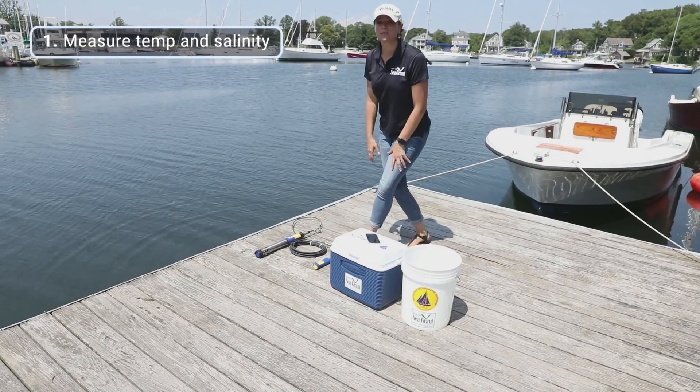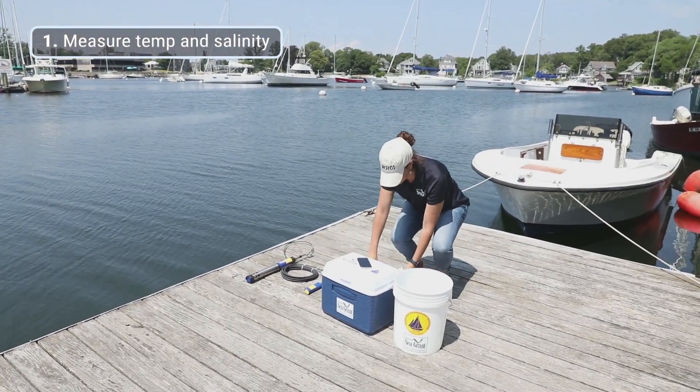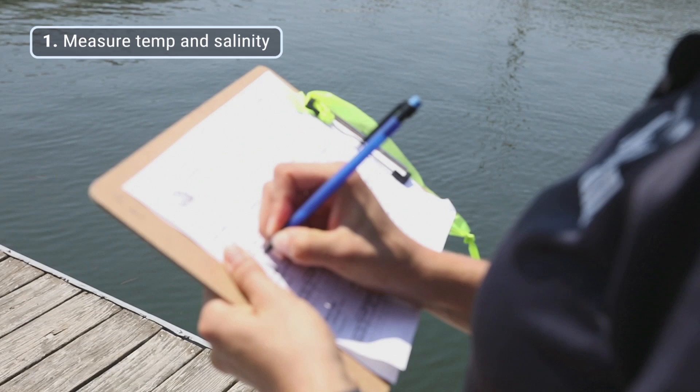It's really important to make sure we know the time that we collected that measurement, so I'm going to write that down on our data sheet.